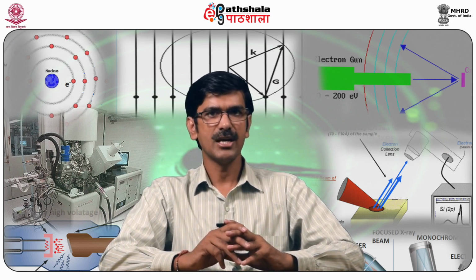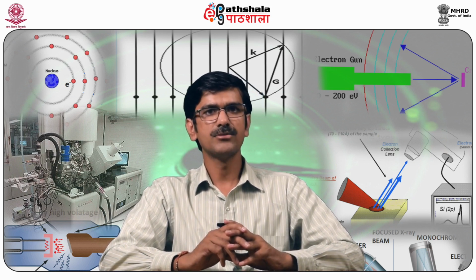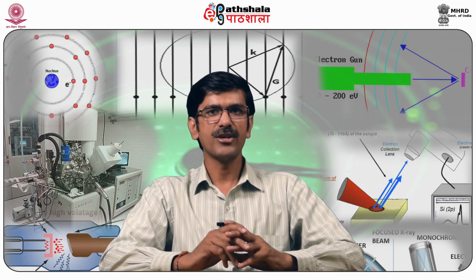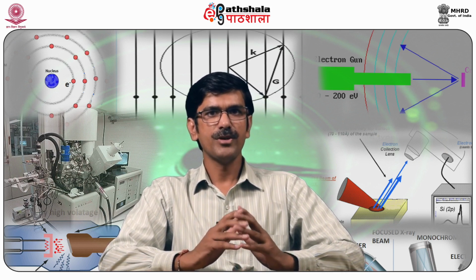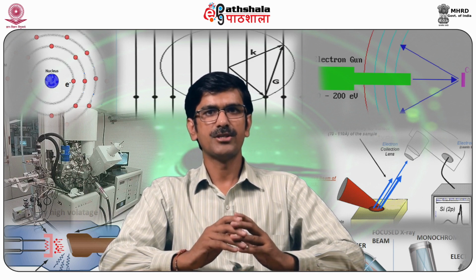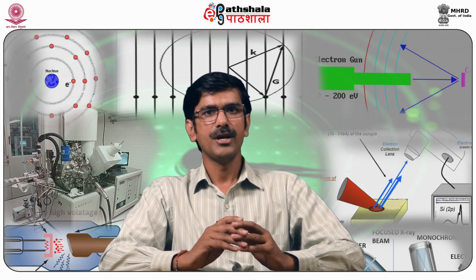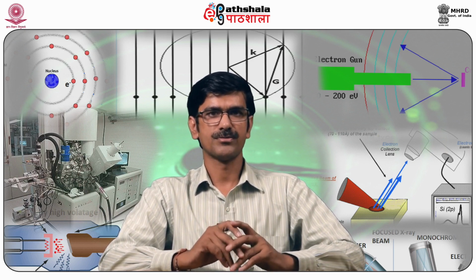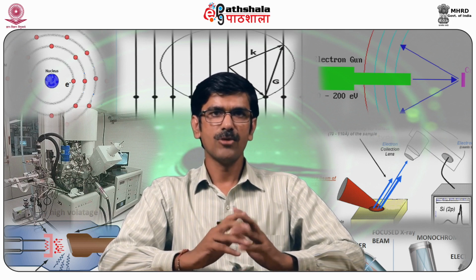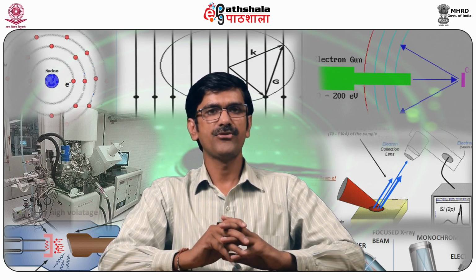Samples can be investigated either in bulk or in microscopic amounts over a wide temperature range and physical forms, that is liquids, gases, powders, latex, monolayers to multilayer films, fibers, or as surface or embedded layers. Raman spectroscopy is best for symmetric vibrations in nonpolar groups, while IR spectroscopy is best suited for the asymmetric vibrations in polar groups.